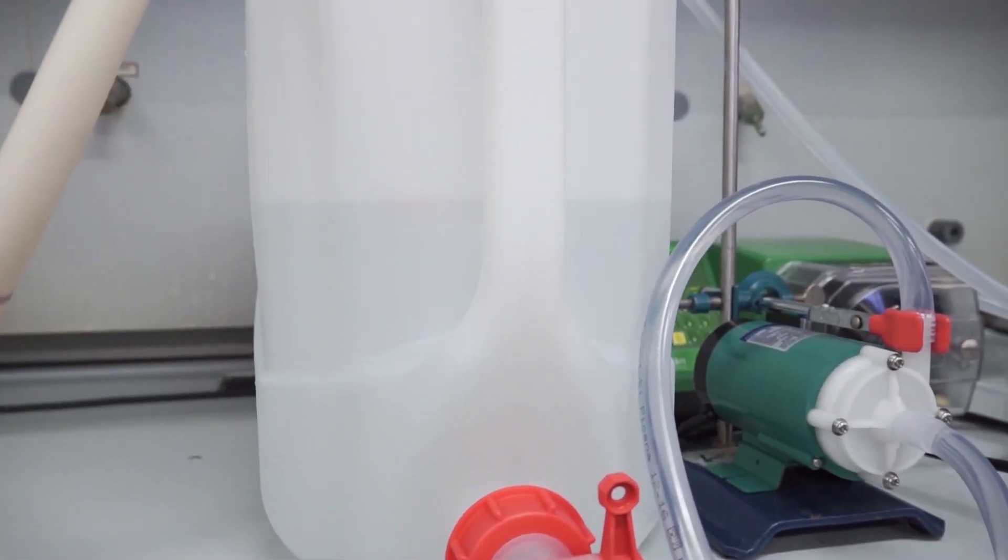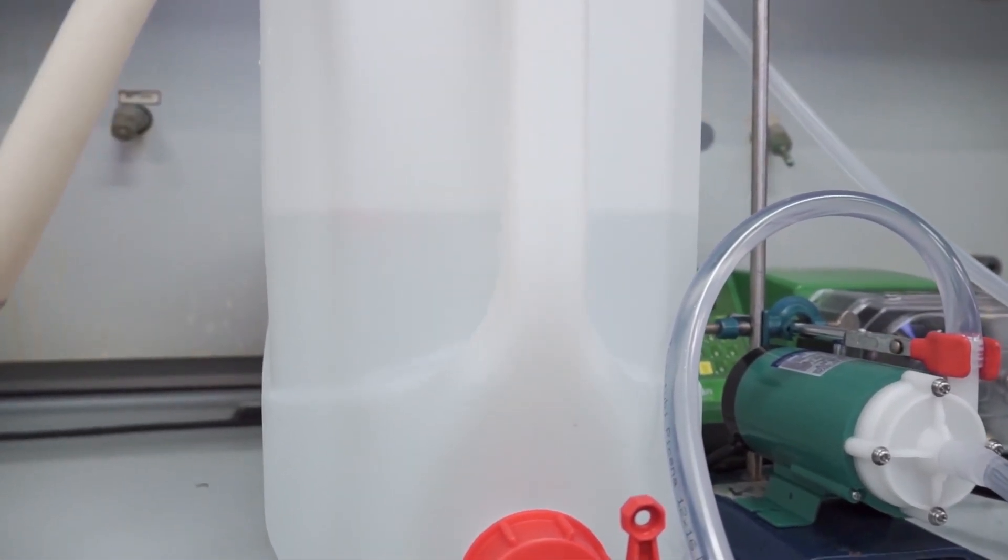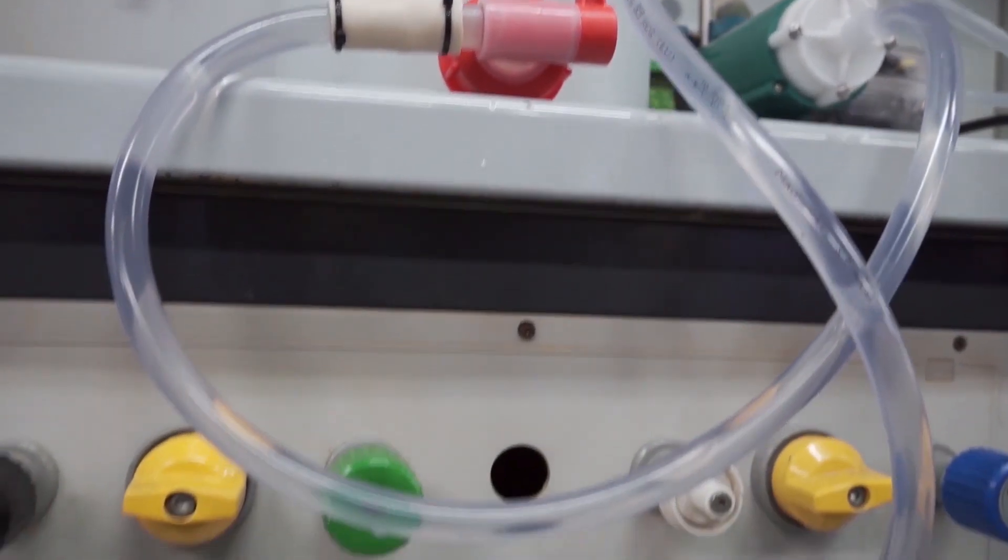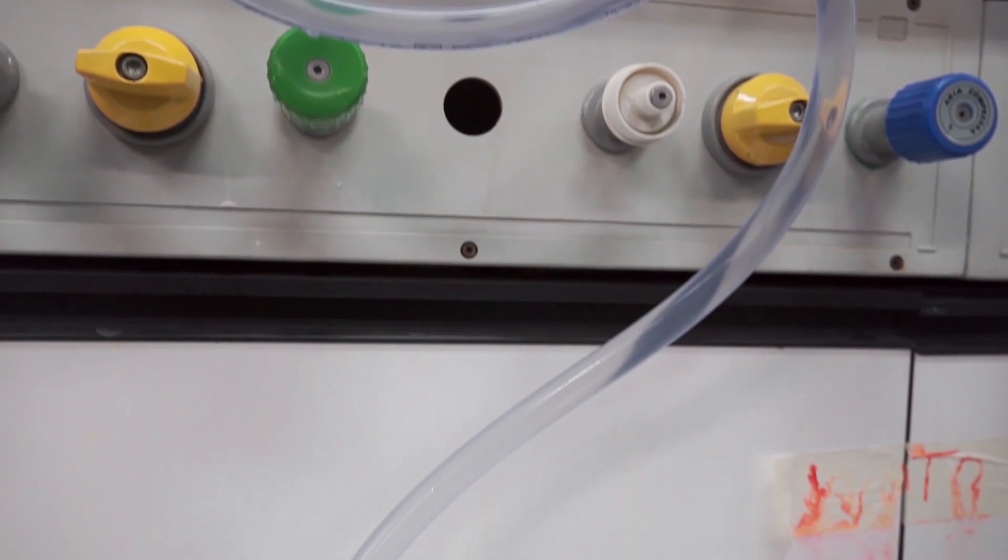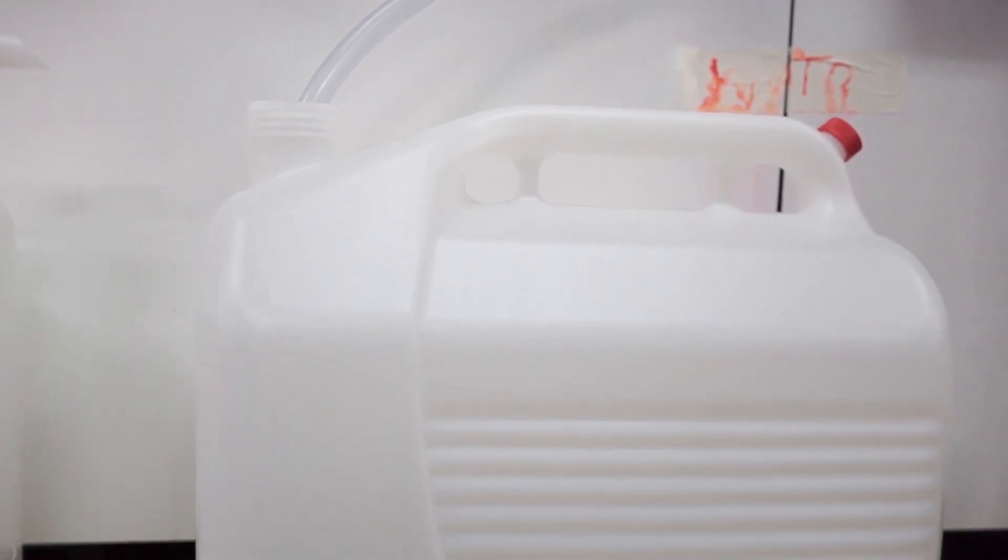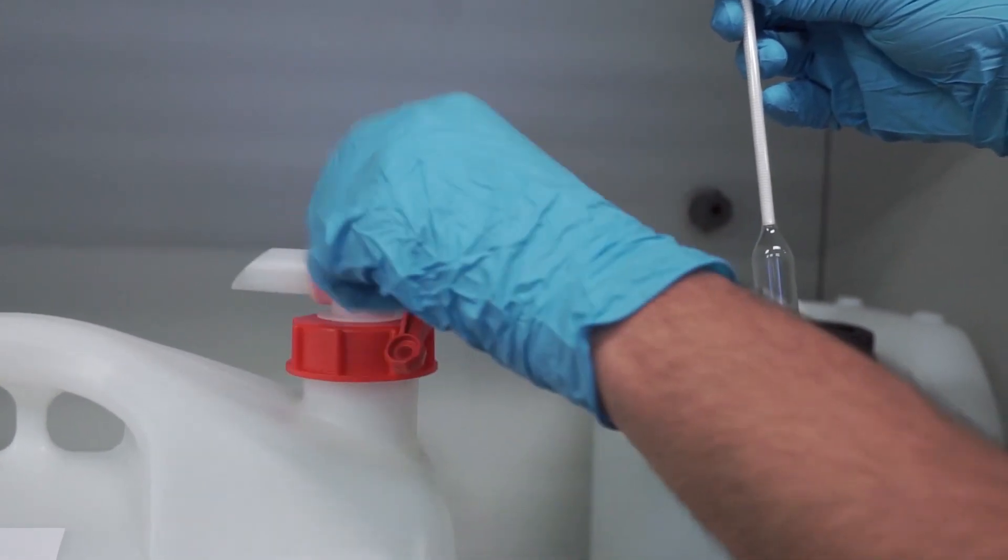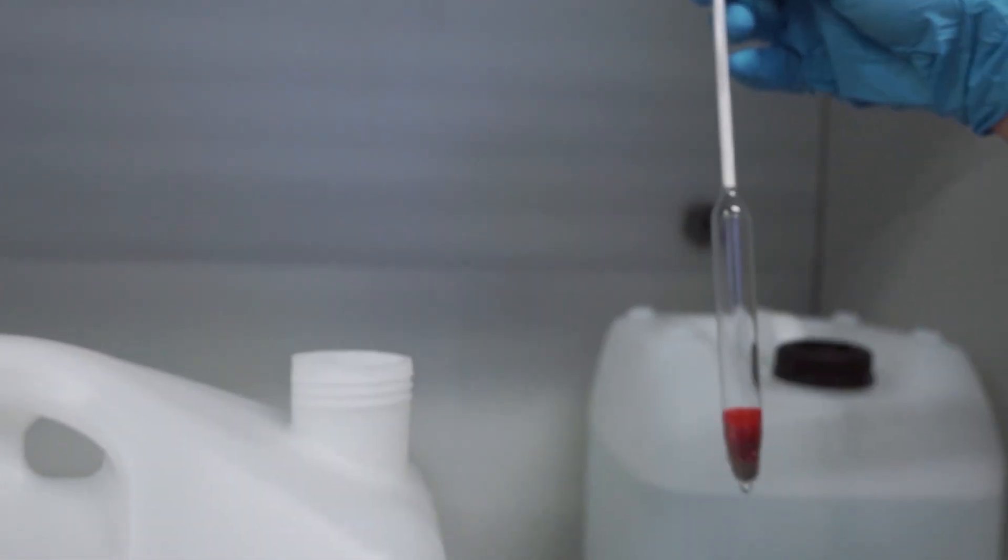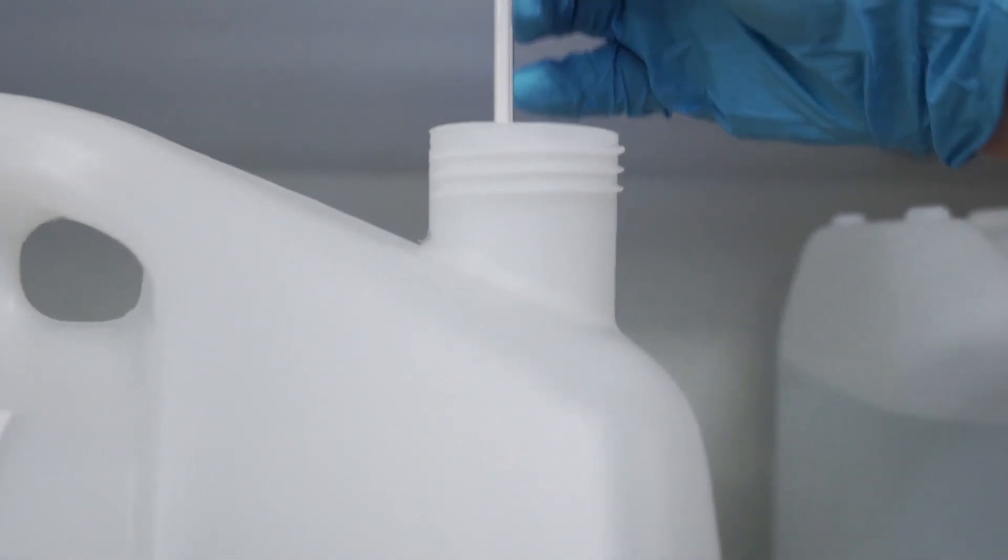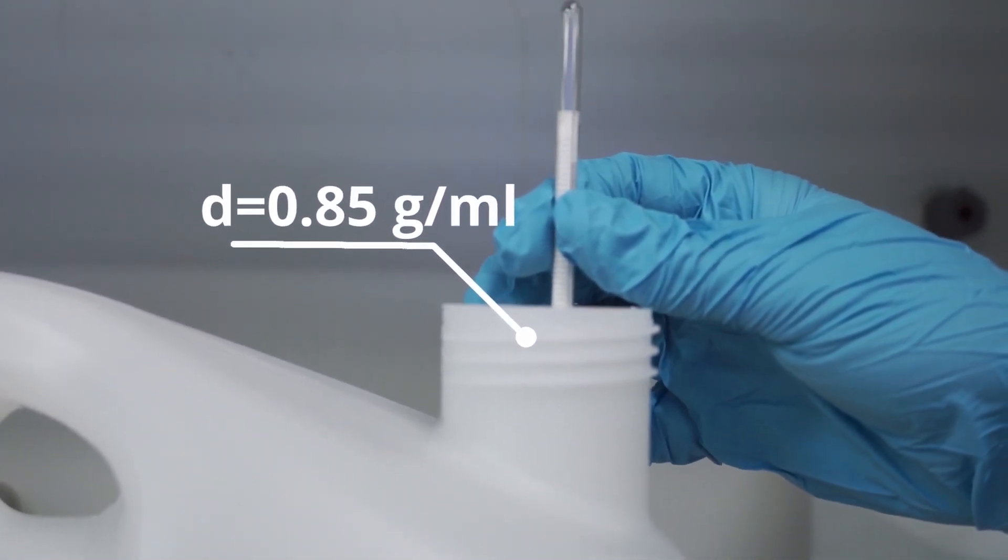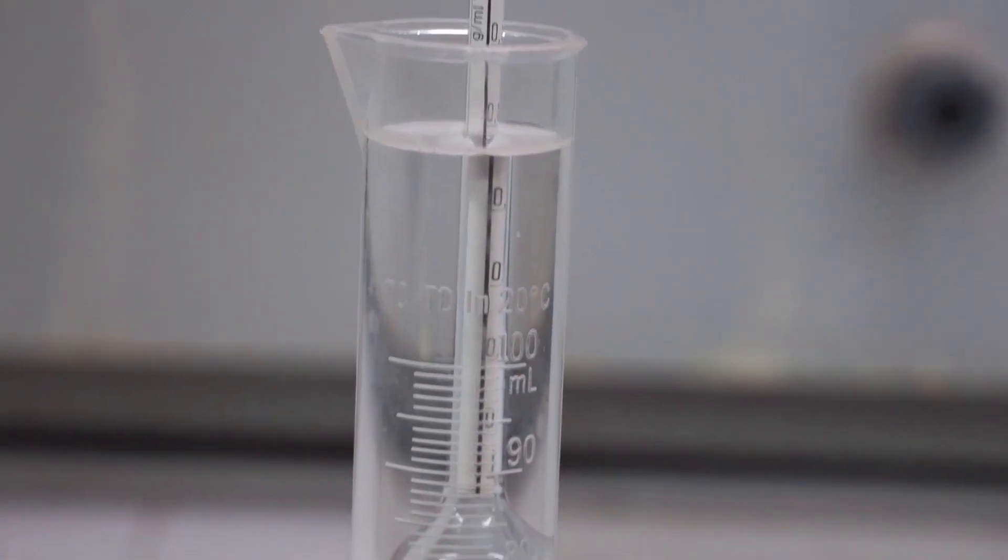Once the final containers are filled with disinfectant solution, it is necessary to carry out a quality control by evaluating its density. Specifically, to verify that the liquid produced contains a percentage of ethanol that maximizes the disinfectant capacity, a quality control test is carried out with an alcohol meter. The sanitizing liquid must have a density of 0.835 grams per milliliter with a maximum error of 5% and rest for a period of 72 hours before use.